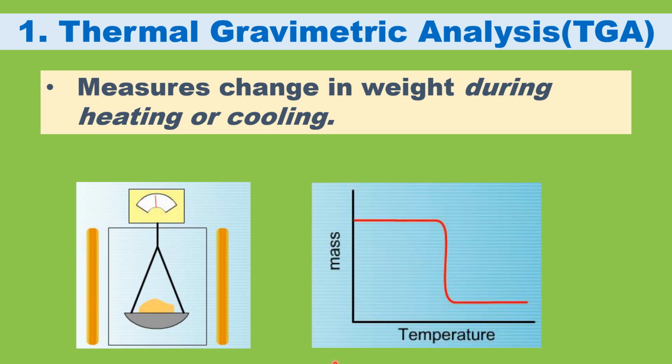Now we can plot the mass of the sample as a function of temperature. This plot is called a thermogram. What is a thermogram? A plot of mass versus temperature is called a thermogram.